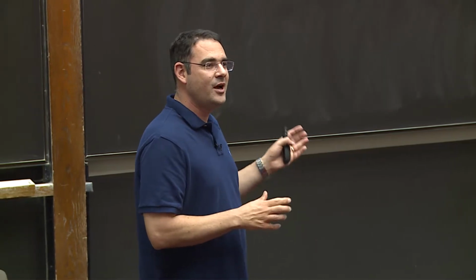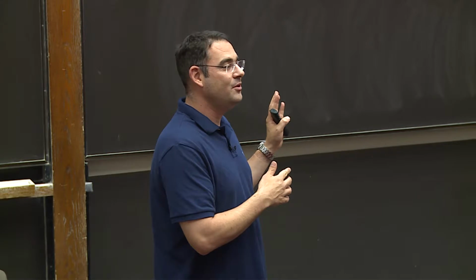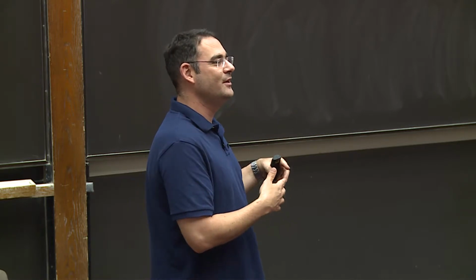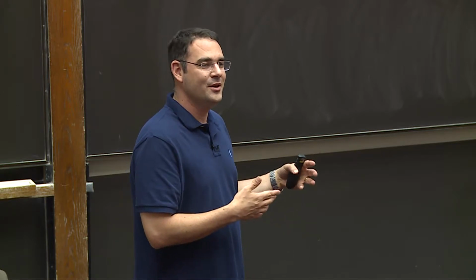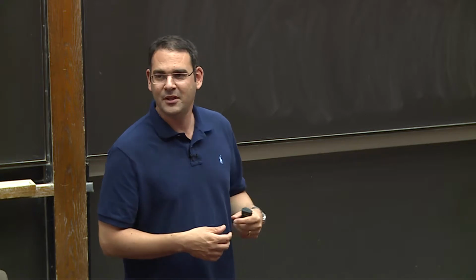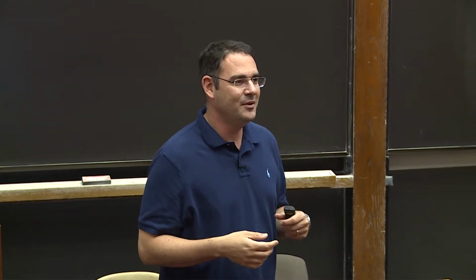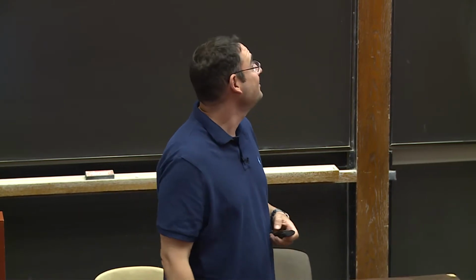So it should not come as a complete surprise that for a different technique in structural biology, where the goal is also to find the three-dimensional structure, I will show you today a mathematical formulation of the problem that leads also to a system of low-degree polynomial equations, and it's a large system that we'll need to solve. So that's a long introduction to the talk, just to keep in mind where we are heading, because it's going to be a bumpy road to get to that stage.